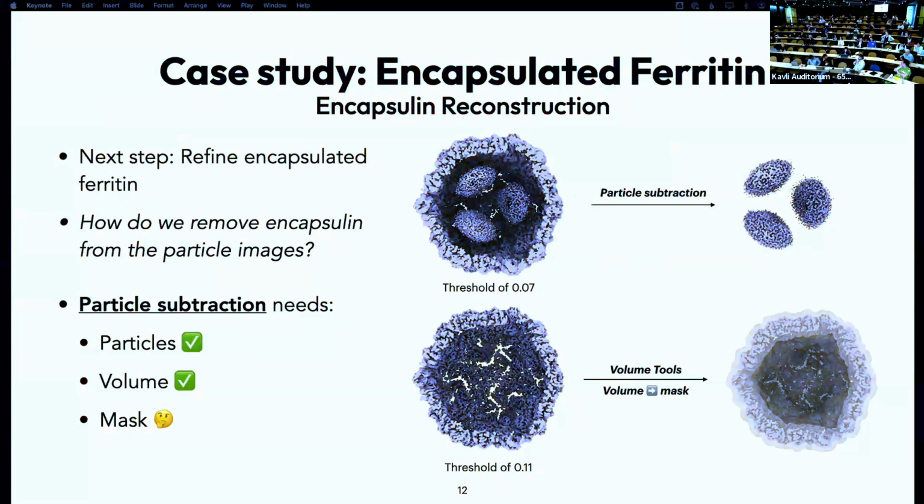And this is an interesting concept because Michael also mentioned that the particle subtraction was a key piece here to be able to actually start looking at the internal parts of the shell. But the particle subtraction depends on us having figured out the pose of the shell just perfectly, right? To be able to subtract it. But those images now after subtraction, although we subtracted away the shell, the pose of the shell is now baked into those images because we used the reference of what the shell looks like to subtract it away. If in some of the images the shell looked a little bit different, that subtraction may not have been perfect. And so in a lot of ways, the poses that we solved at this point are really baked right into the whole workflow. Yeah. That's a great question.